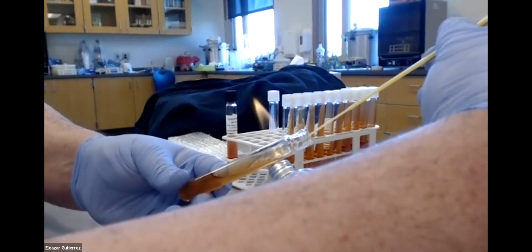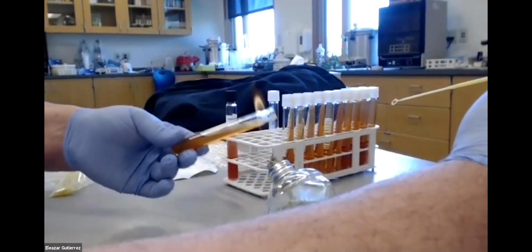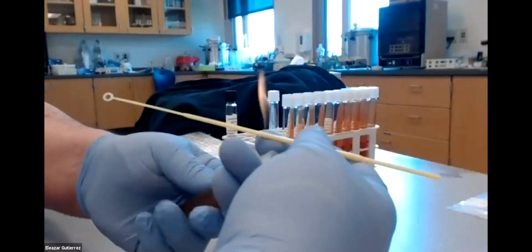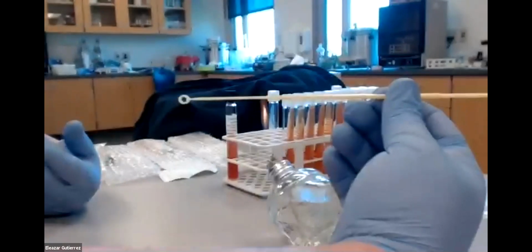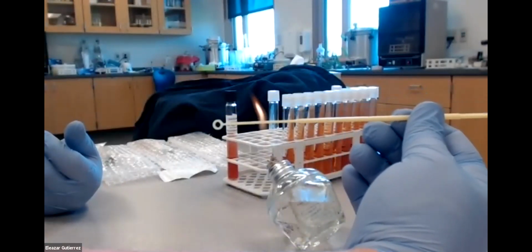Okay, just like that. Once I get to the top, at a 30-degree angle, I'm going to flame it. 1, 2, 3. I'm going to recap it, make sure it's labeled with E. coli. And I'm done with that tube, and then I can do the other two. Okay, this goes into 70% isopropyl alcohol in order to disinfect it.